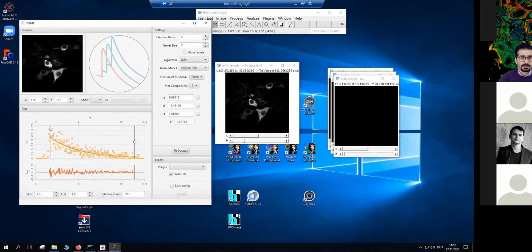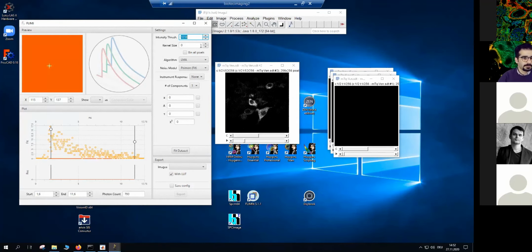And what I can do is apply some thresholds. So here, for instance, is about 1,300. Oopsie. 500. That's still a lot. No, that was 130. So I would just put it at 200.